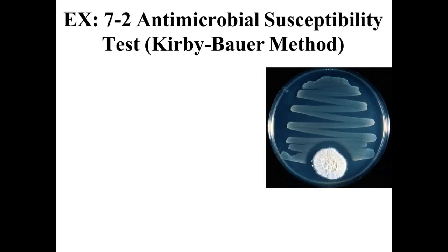It's a mold. Specifically, penicillium, which produces an antibiotic we're familiar with known as penicillin. This stuff, streaked out on the rest of the plate, is a bacteria. Probably something like Staph epidermidis, a gram-positive bacteria. What did that mold do to that bacteria? It killed it, because that mold is actually producing penicillin. It's a chemical, right? It's diffusing into that media, and it actually kills the bacteria.